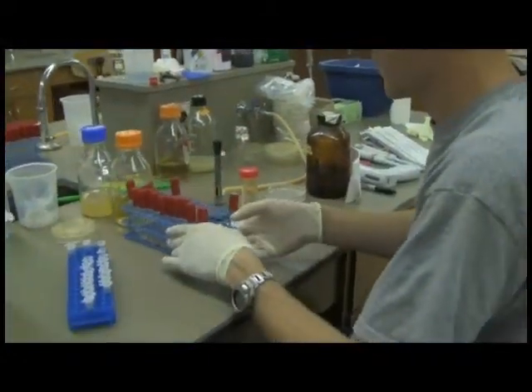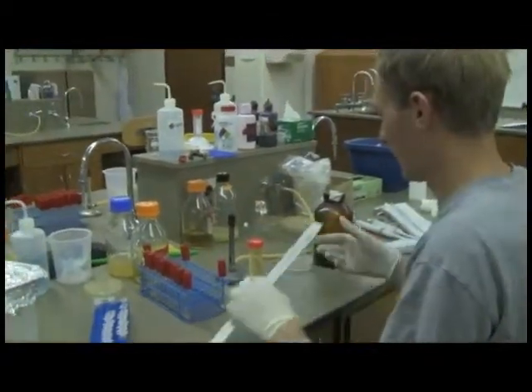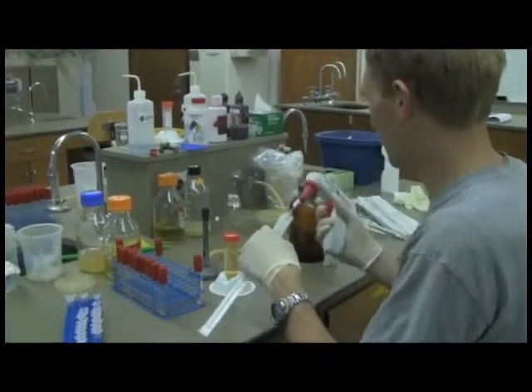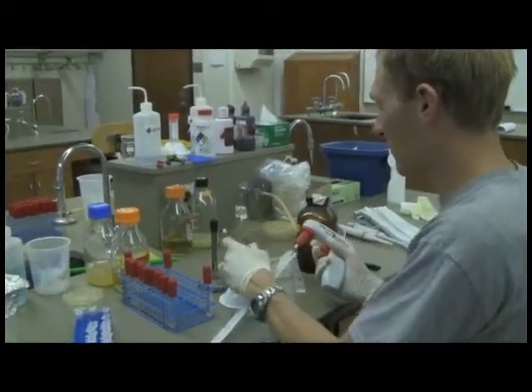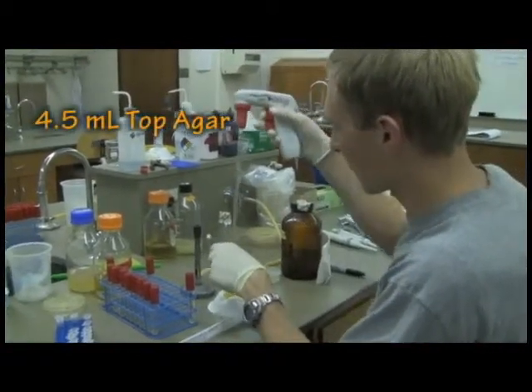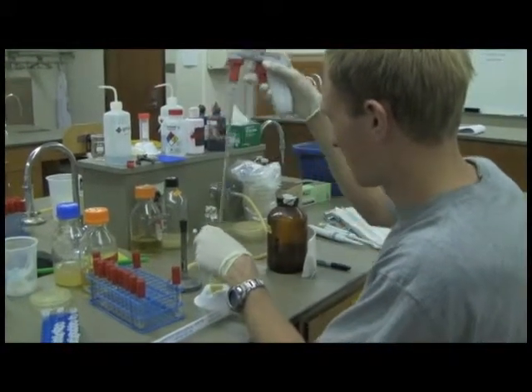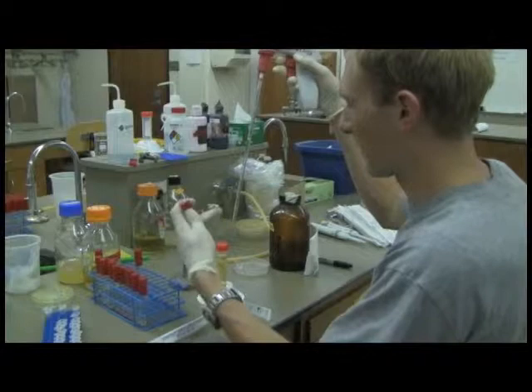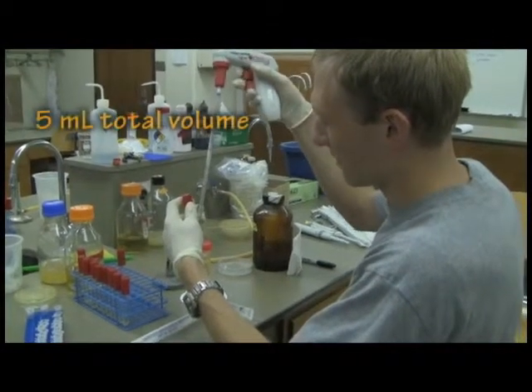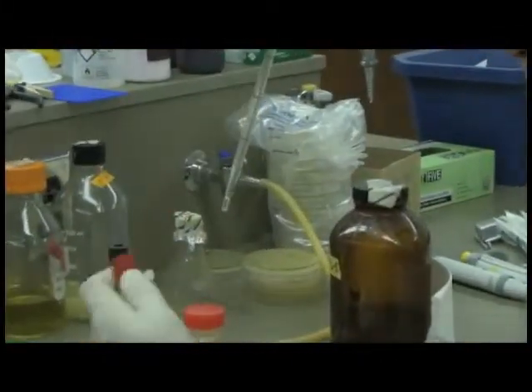Okay, so now we'll take our bacterial sample that's been infected with the phage, and we'll grab a 5 milliliter pipette, and we will remove 4.5 milliliters of top agar. It's been mixed and is now cool. And we'll put it in our bacteria and phage. It's always good to mix a couple times, just so you make sure the bacteria is spread out in the mixture.